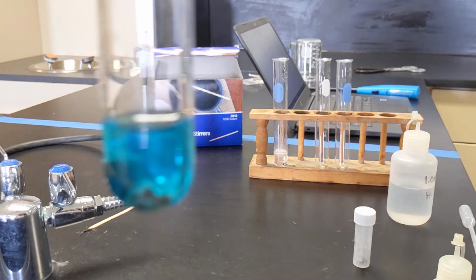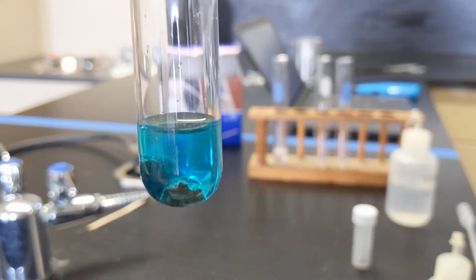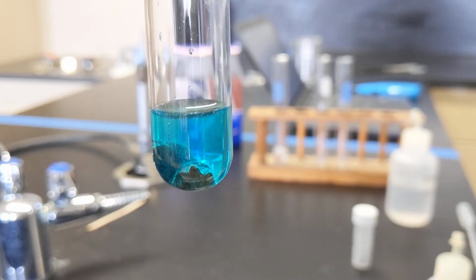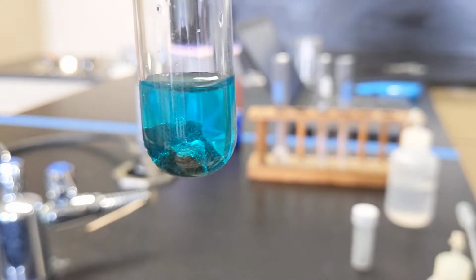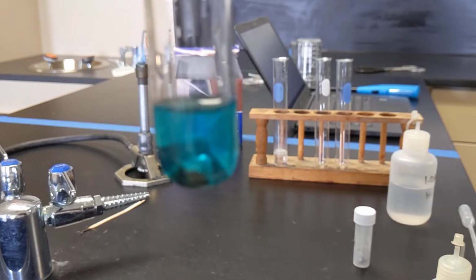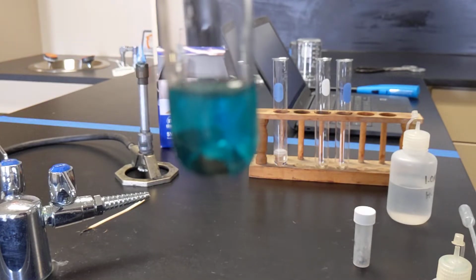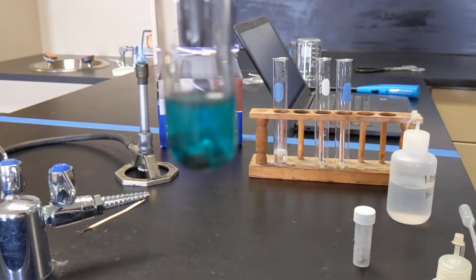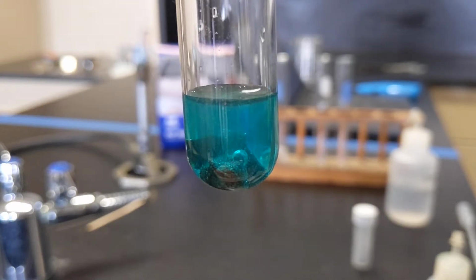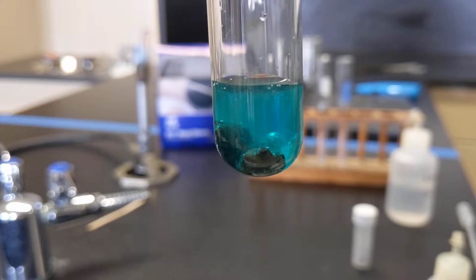Let me try to refocus my camera. There, it's better. So little tiny baby bubbles. There, that's a good one. So there's definitely a reaction happening. This reaction takes a while to go to completion. So we might need to take a break. The camera does not want to stay focused. There it goes. Keeps wanting to focus on the background.